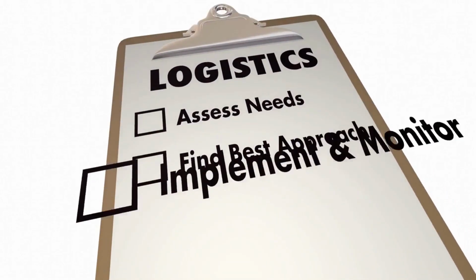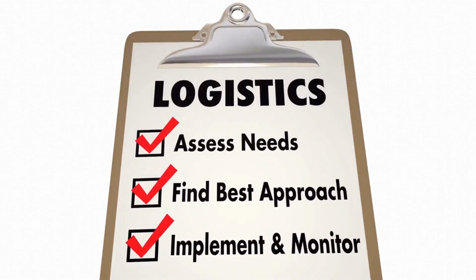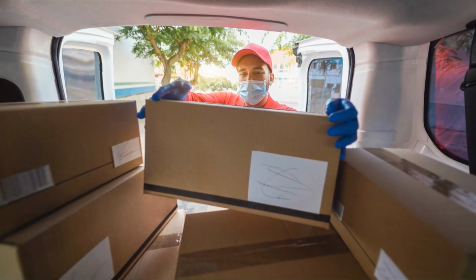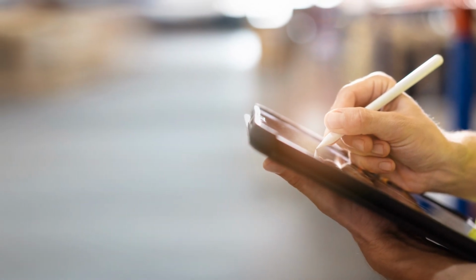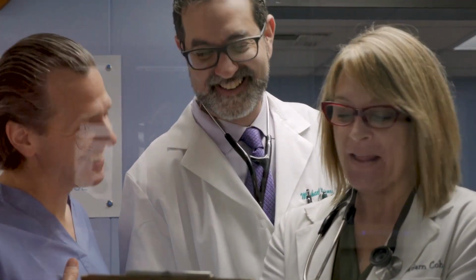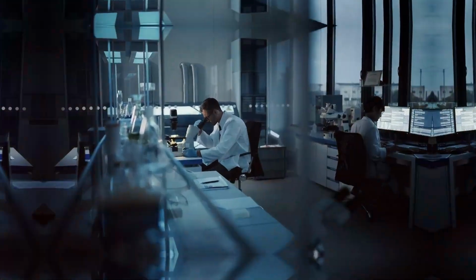Documentation continues to play a vital role during transport, ensuring traceability and accountability. This might involve using a sample transport log to track the movement of samples, recording the date and time of dispatch and receipt, and noting any deviations from standard transport conditions. Accurate records are essential for quality control. This documentation provides accountability and helps identify potential areas for improvement in the transport process, ensuring continuous enhancement of sample handling procedures.